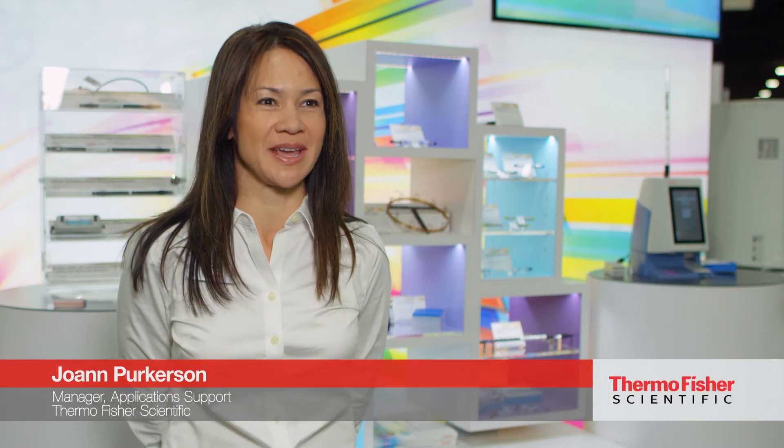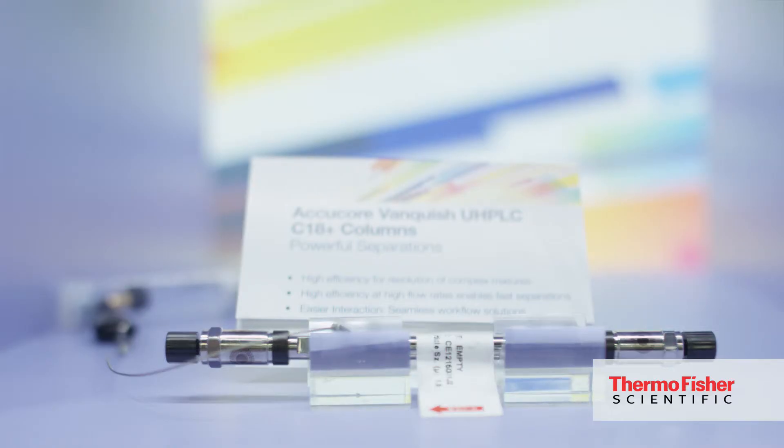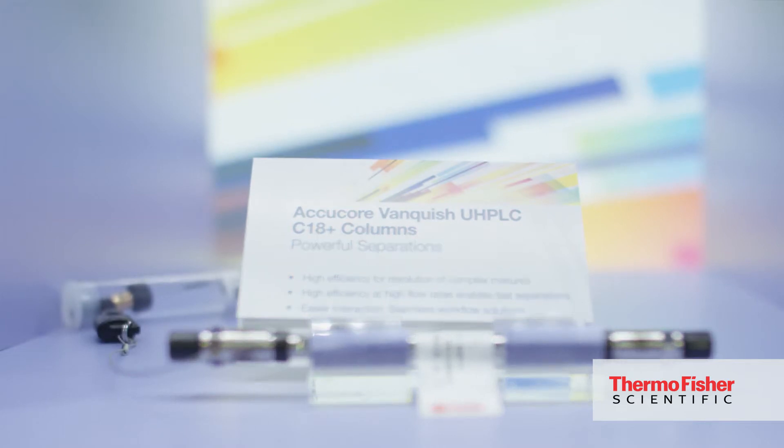We're talking about columns and consumables today — specifically the Validated for Vanquish columns and the AccuCore Vanquish columns. These columns are designed to go in the platform of the Vanquish UHPLC system.